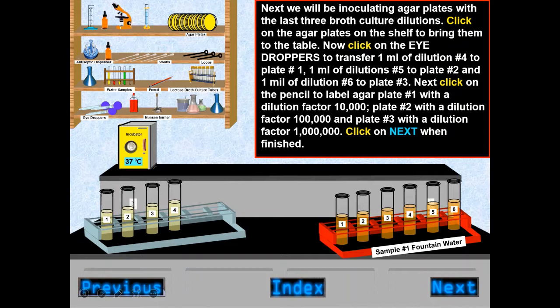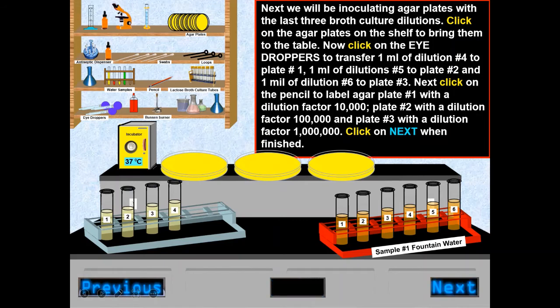Next, the agar plates were inoculated with the last three broth culture dilutions. The eye dropper was used to transfer 1 ml of dilution number 4 to plate number 1.